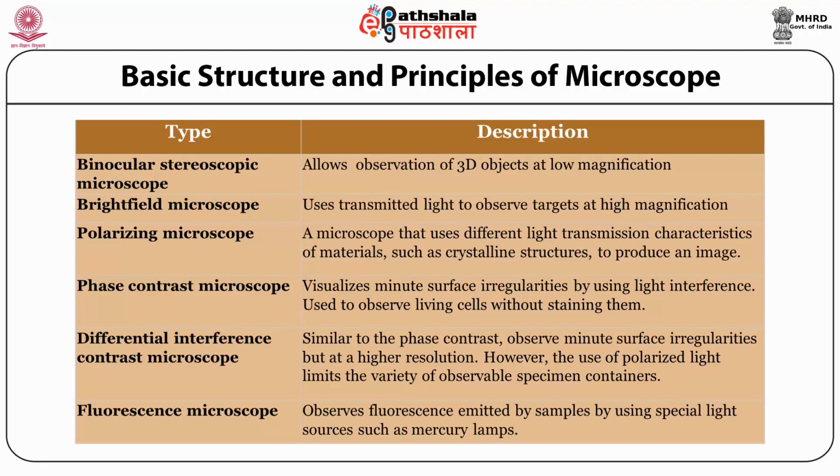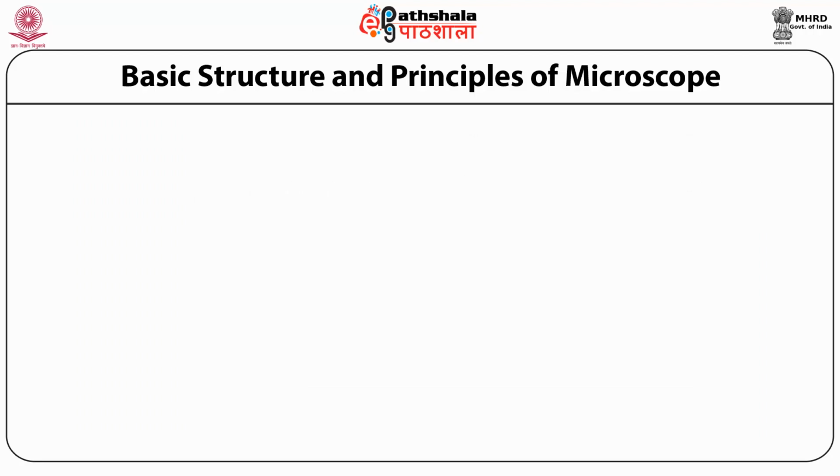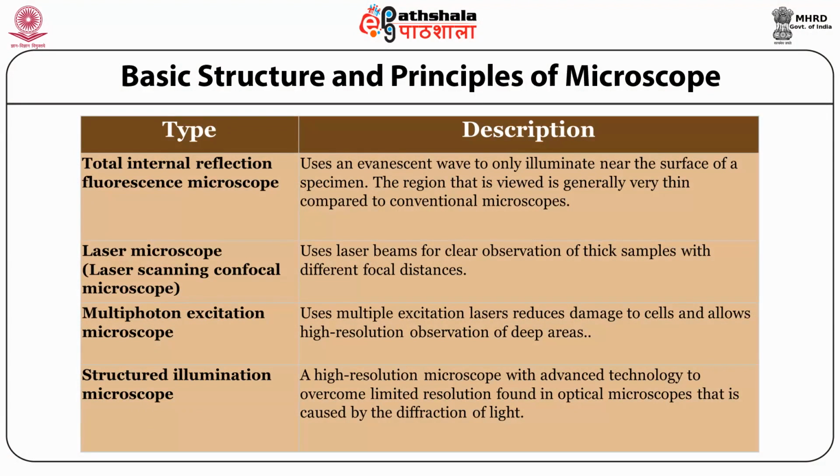These will be discussed in detail in the next module. Also, we have the high-end applications of microscopy, where we have the total internal reflection microscope, very important and very crucial for the imaging of membrane. Then we have the confocal microscope, two-photon microscopy as well as multi-photon excitation microscope, and we have SIM, structured illumination based microscopy, to get a higher resolution and more information about the sample composition.